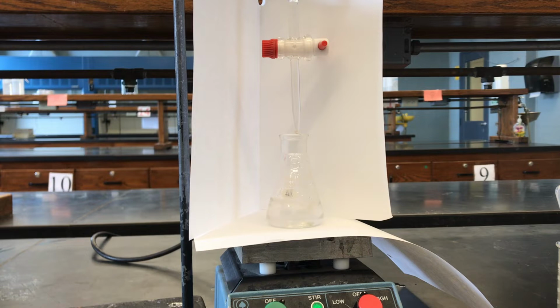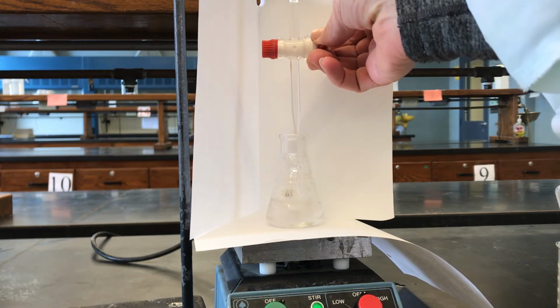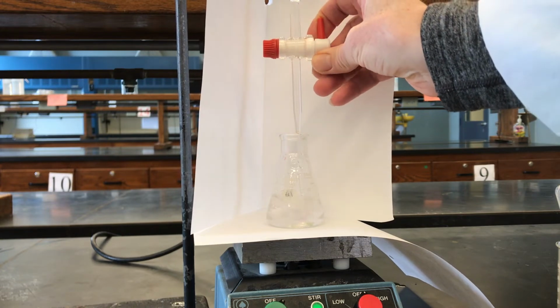All right, so I have my flask underneath my burette. I'm ready to titrate because we have the initial volume, and I've just put a bit of a white background so that hopefully you can see the color change. So what you do initially is you go pretty fast. So I'm just going to let this titrant run right into the solution, and nothing's really happening yet.